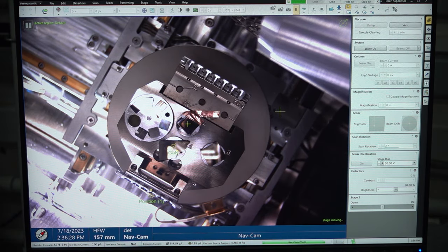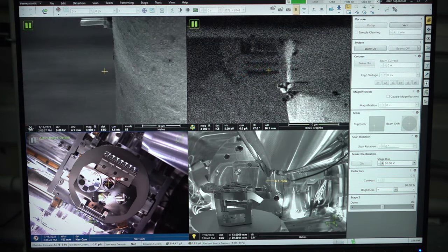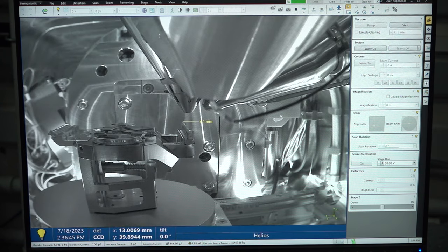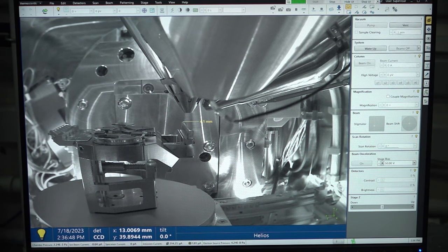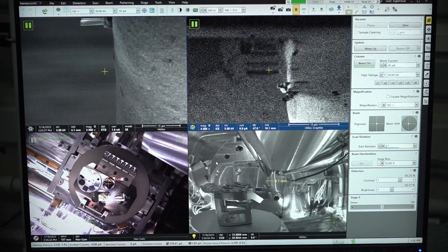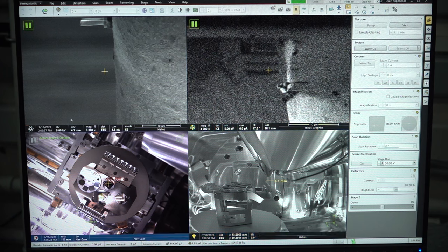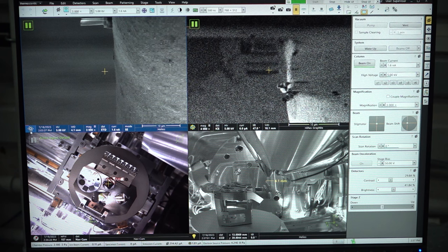The current image has been captured here and we can see the sample which is loaded inside the chamber. This quadrant is for the camera where we can see different components. Whenever we move the stage, we keep the navigation camera on. There are totally four quadrants: one is for the camera, one for the navigation image, one for the electron image which is the SEM image, and the next quadrant is for the ion image. Since it is a dual column system, we will first start with the SEM imaging.